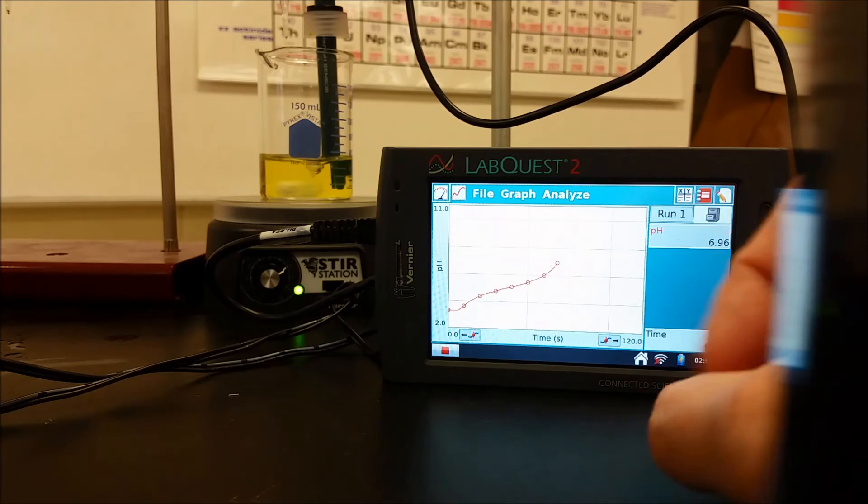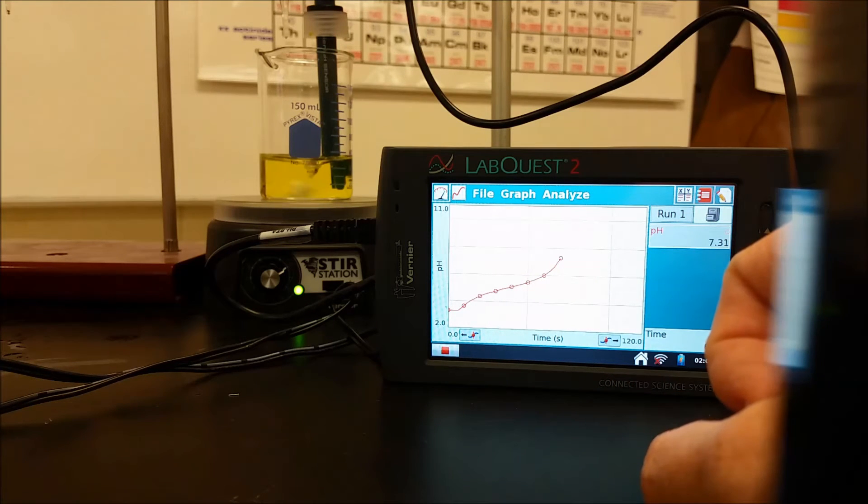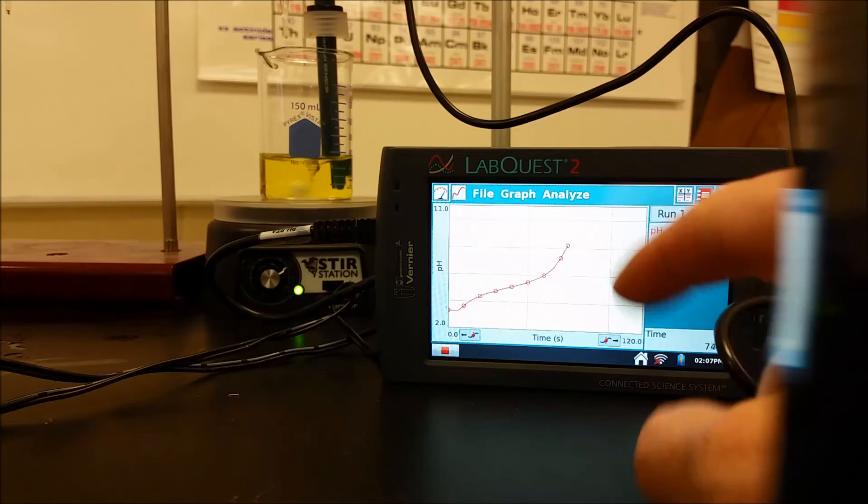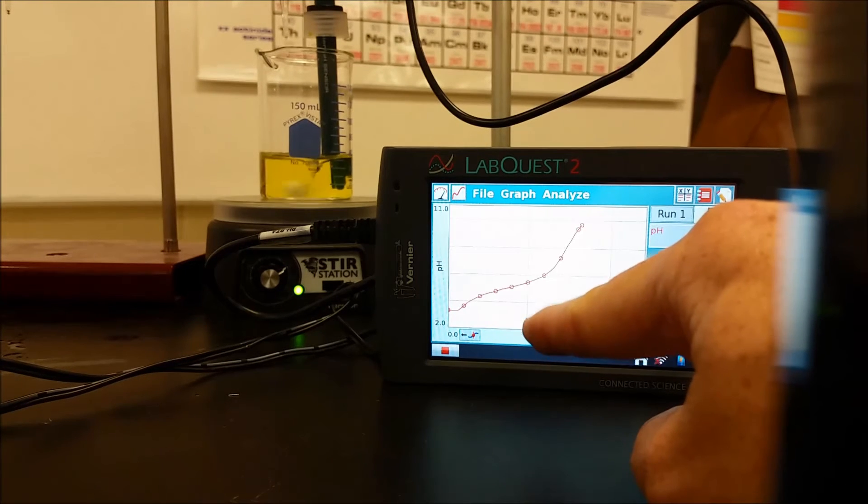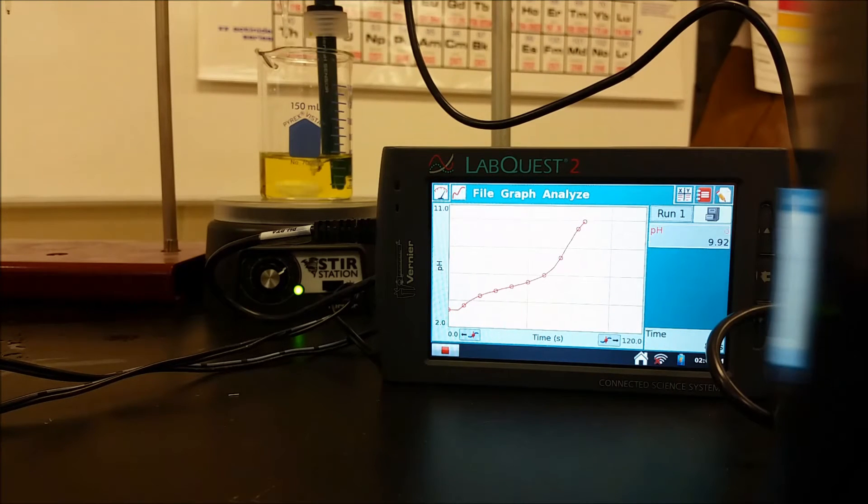Our equivalence point is going to be when there's the large inflection. So you can see here that the slope is increasing very rapidly all of a sudden. That is our equivalence point right now. And so if you trace that down to the bottom of the screen, that's the volume of base required to get to the equivalence point compared to where our endpoint told us the reaction was over. So by choosing the wrong indicator, our answer is off by a significant quantity.